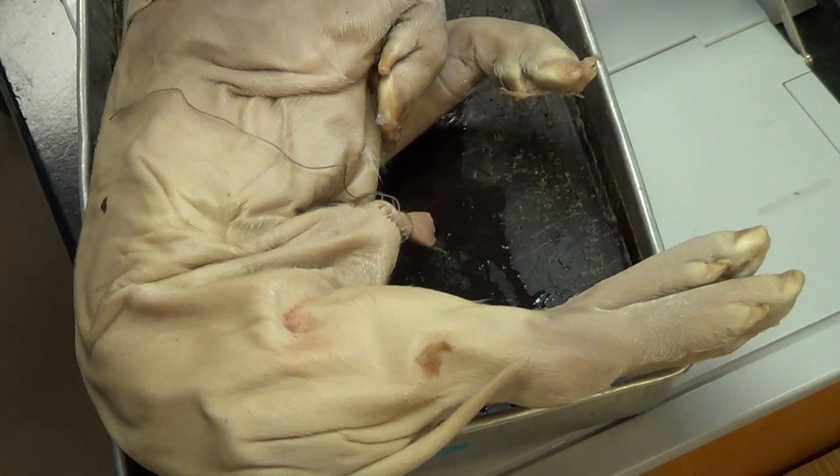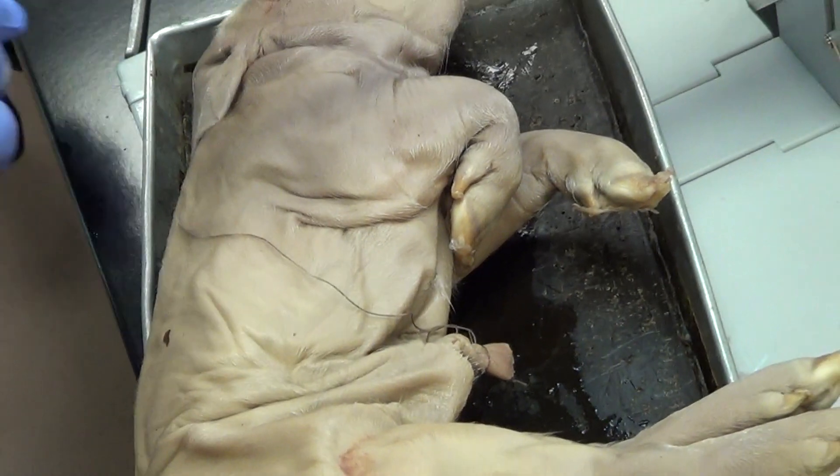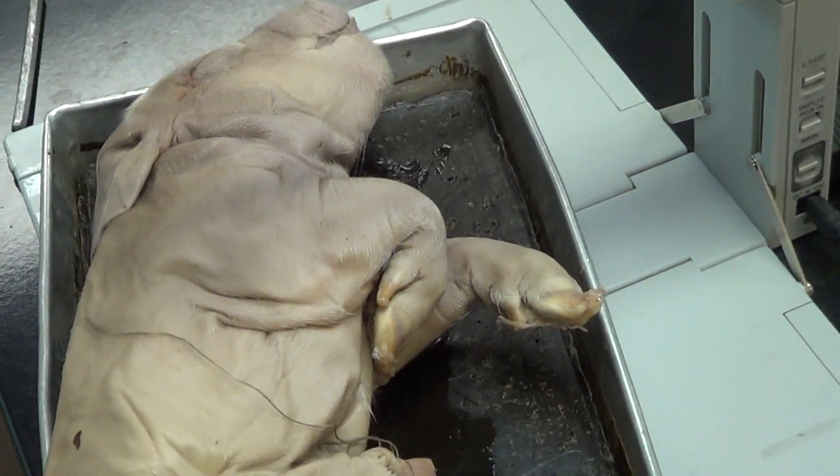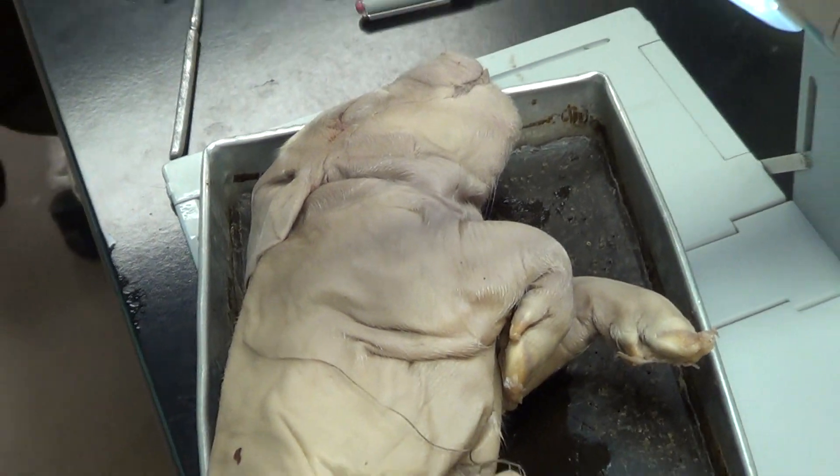It just splattered on my leg — all over my new shoes. Oh well.